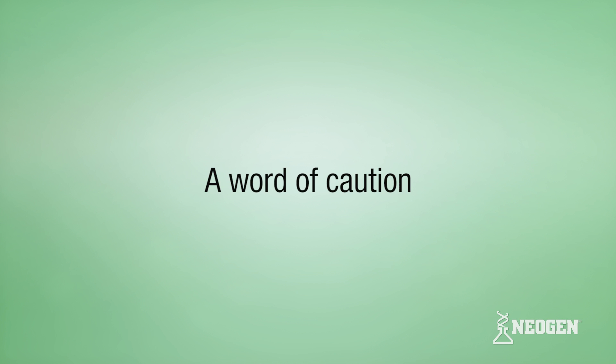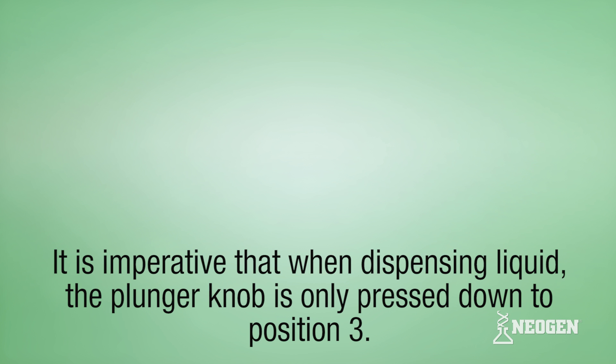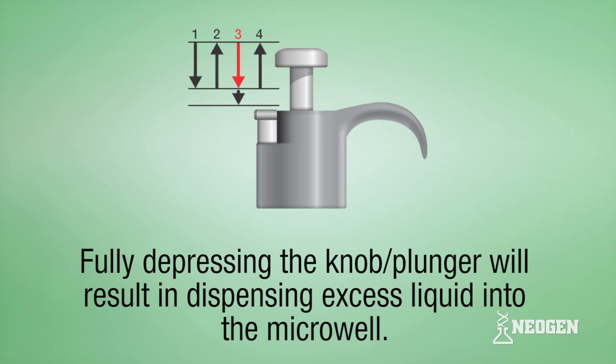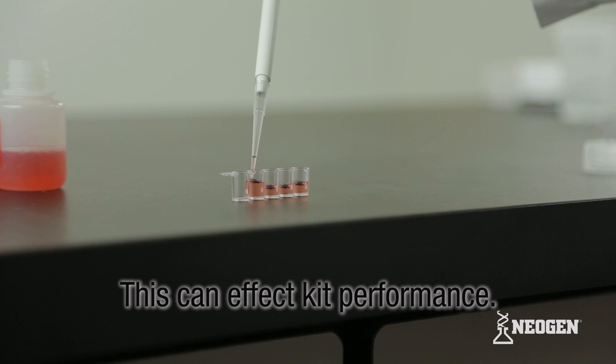A word of caution with this technique: it is imperative that when dispensing liquid, the plunger knob is only pressed down to position three. Fully depressing the plunger will result in dispensing excess liquid into the microwell, which can affect kit performance.